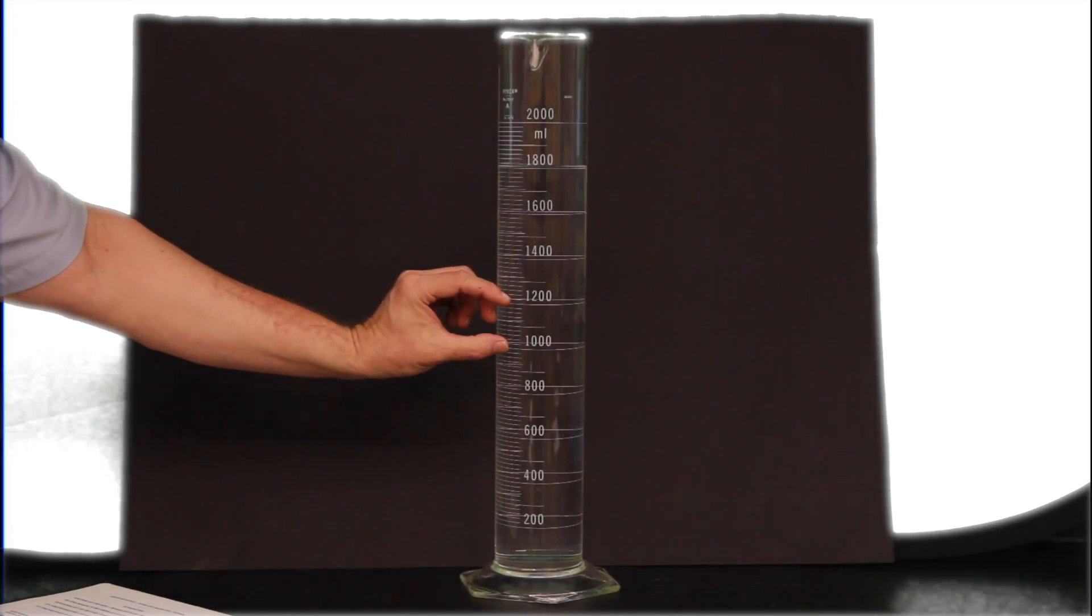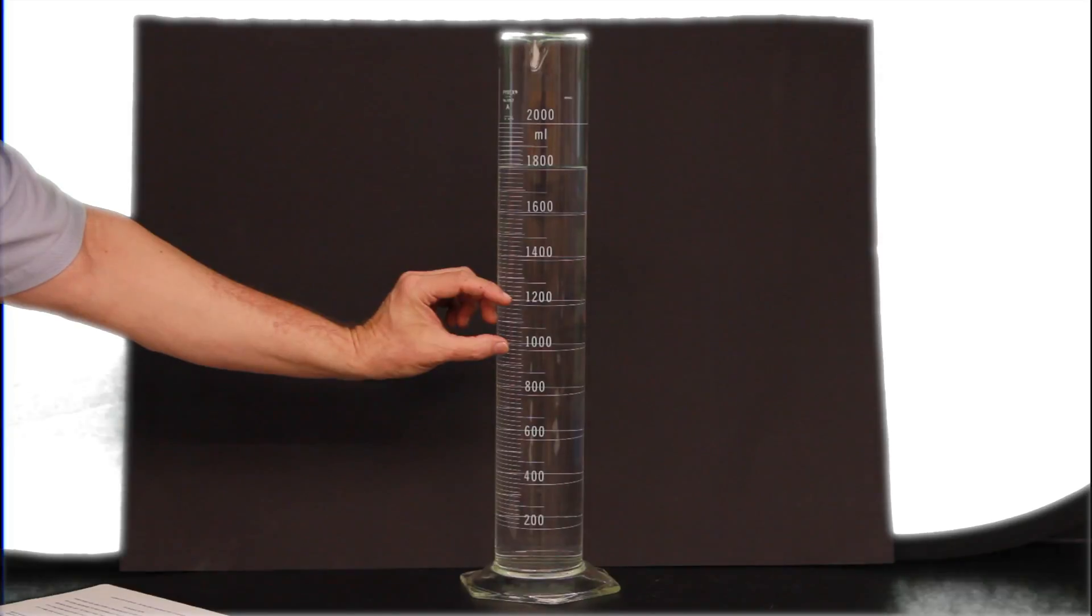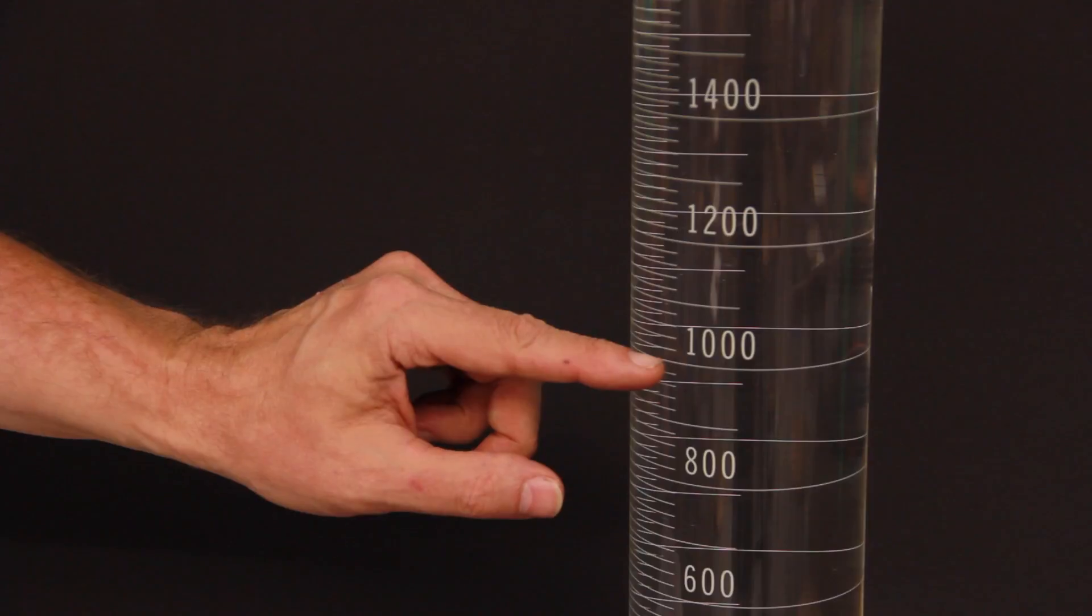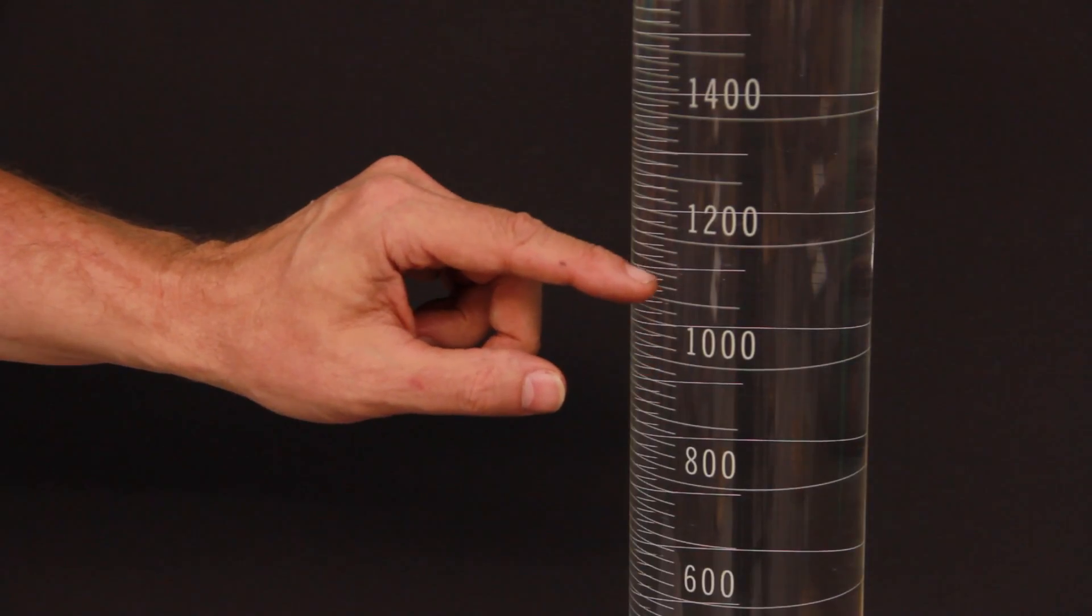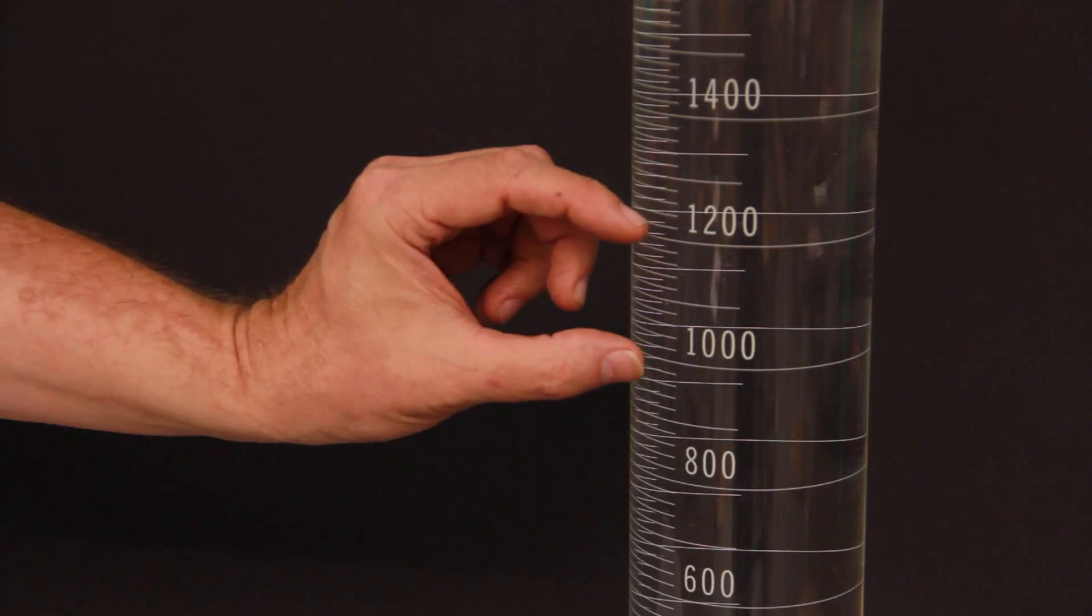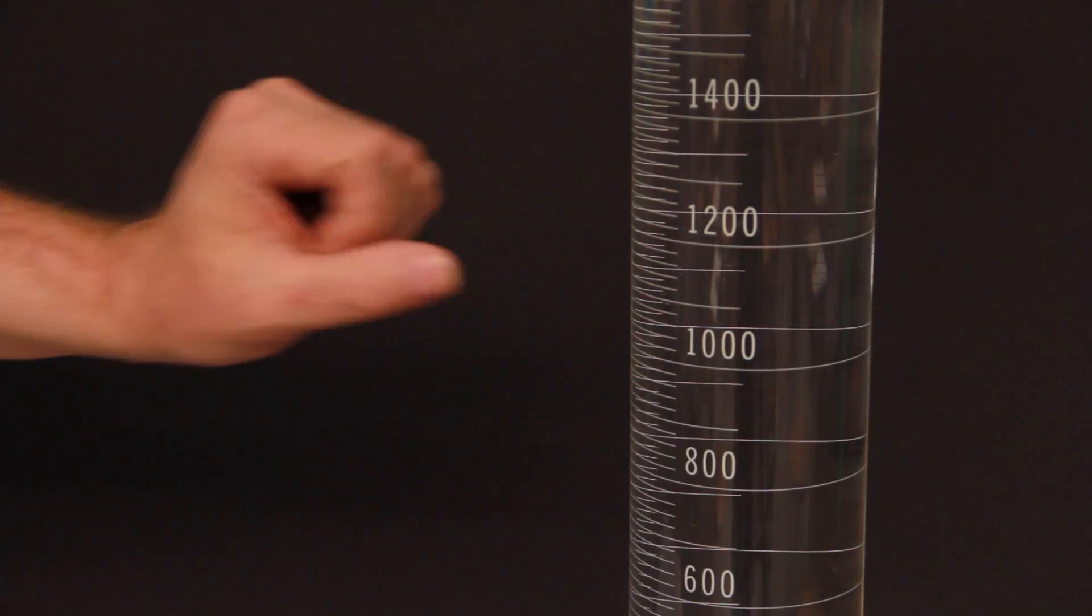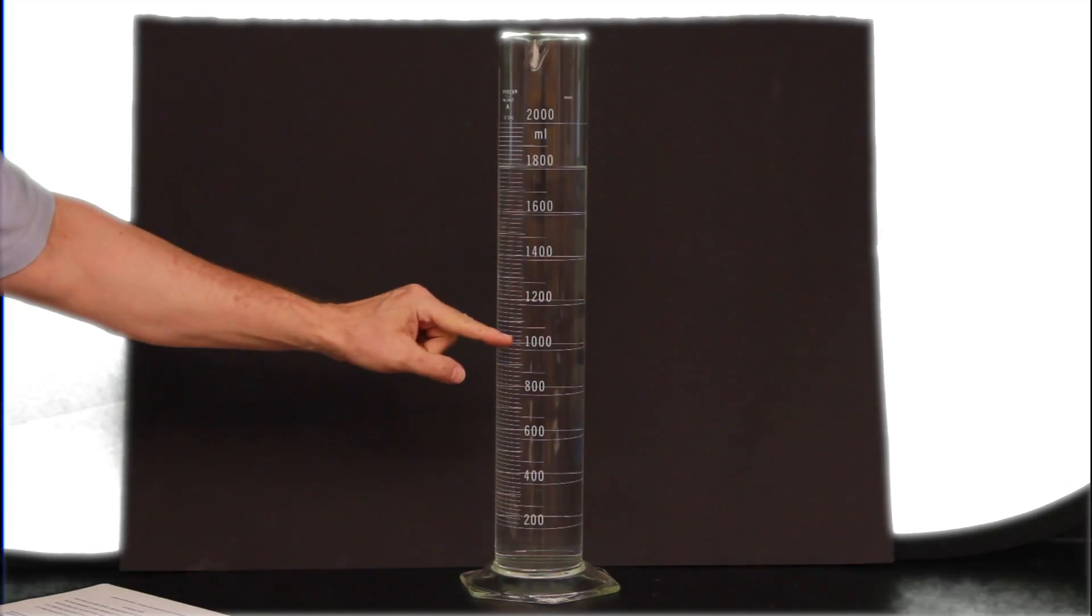To determine what an individual line means on the graduated cylinder, you first need to find two numbers side by side on the cylinder. Starting at the lower number, count how many lines it takes to get to the larger number. Then, get the difference between the two numbers. Divide the difference by the number of lines you have counted. This will tell you how many milliliters each line represents.